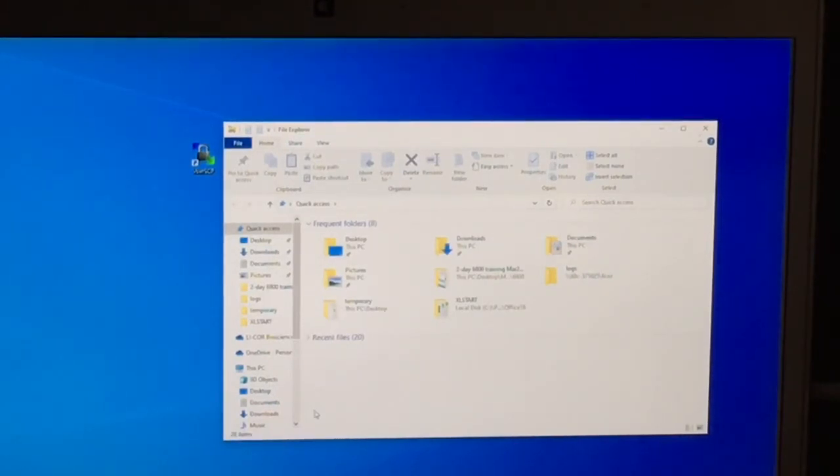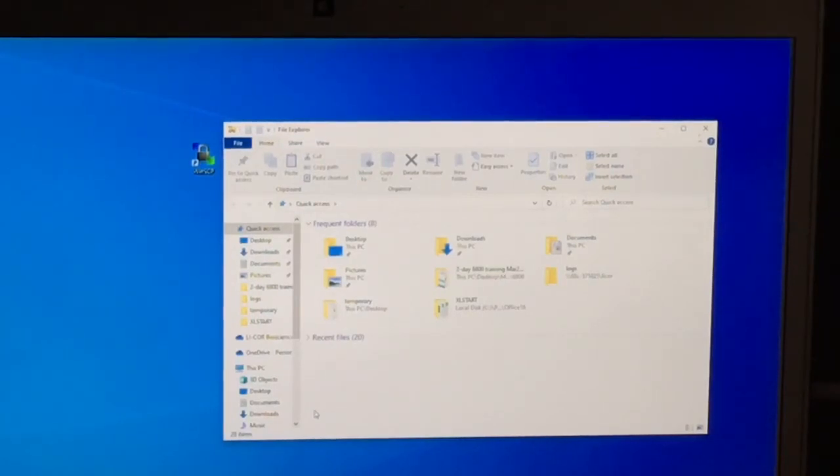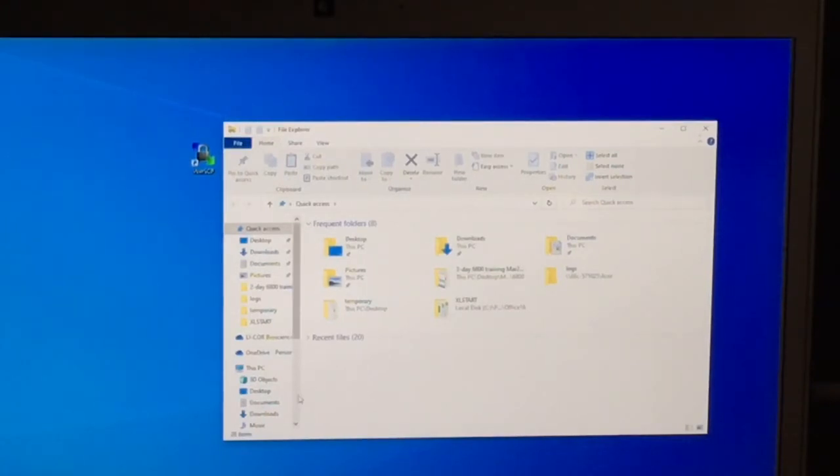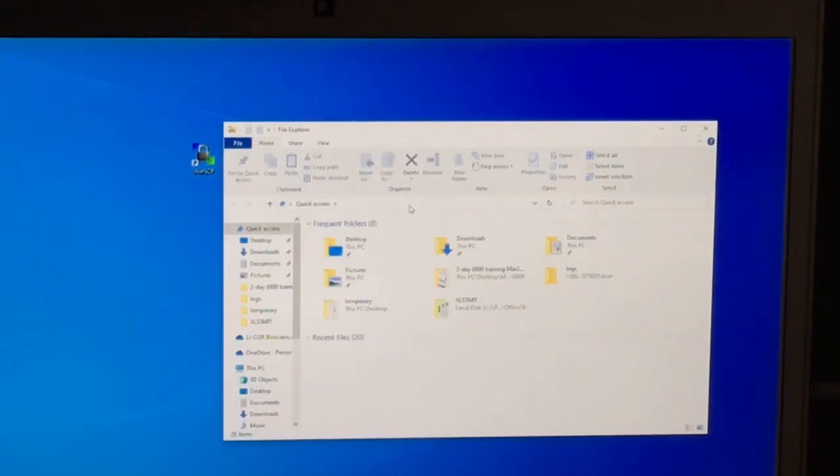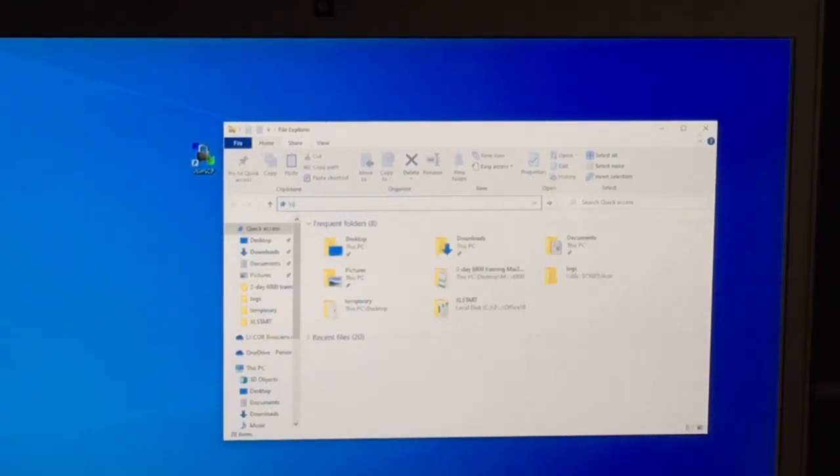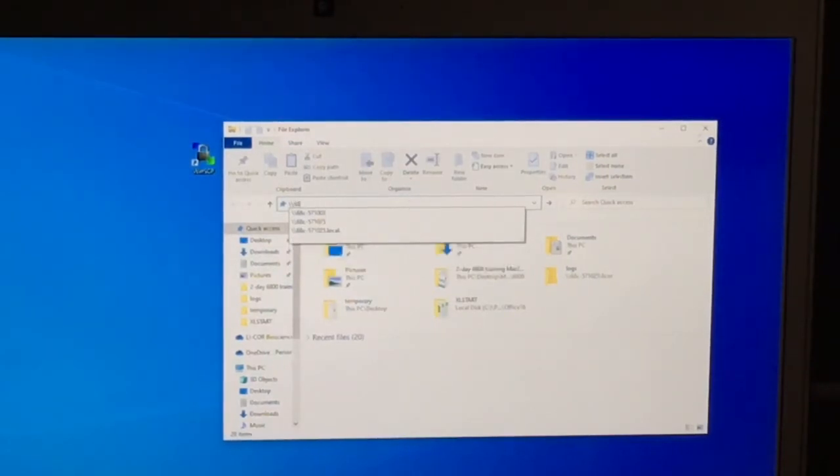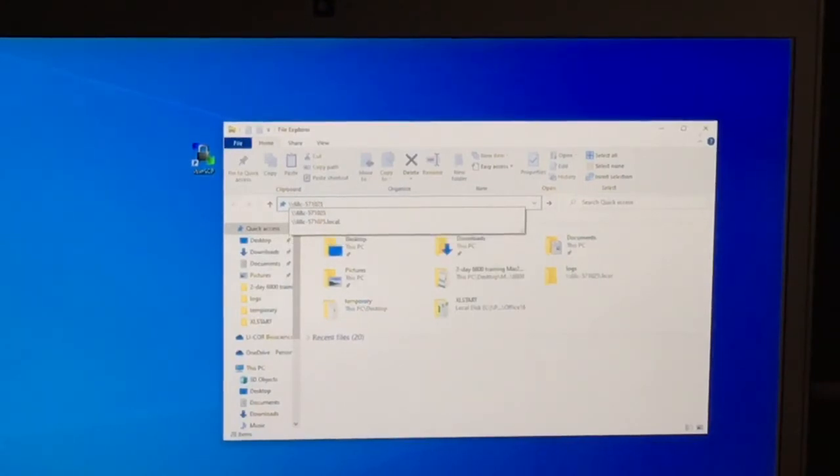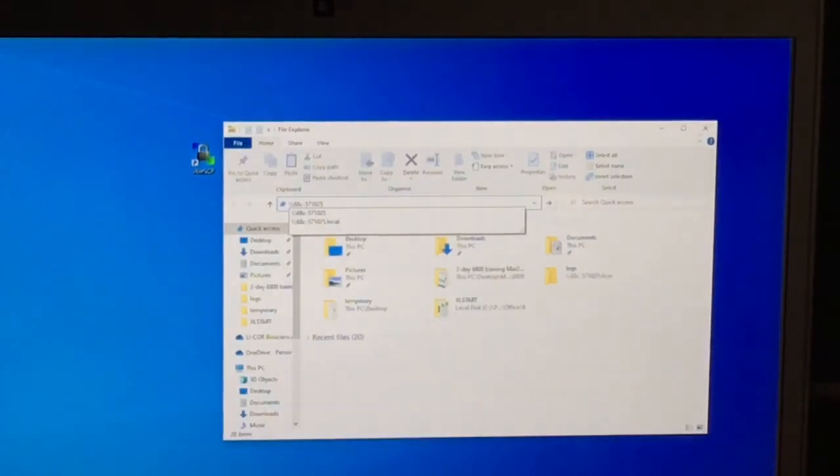For Windows operating system users, go to your computer and open a Windows Explorer window. In the address bar, enter two backslashes followed by the serial number of your console. For this instrument, it's backslash backslash 6ac-571025. Then, press the enter button on your keypad of your computer.